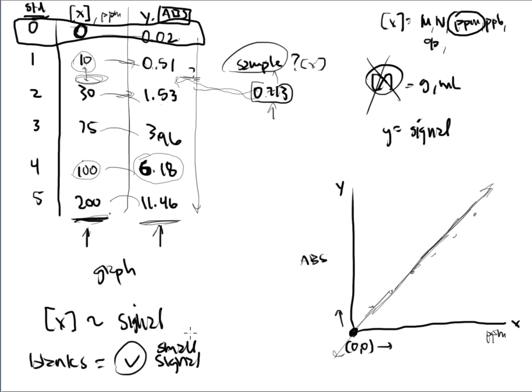That's normal. The instrument, there's air associated with it. There could be air associated with the solvent, the blank that you've used. Maybe it contributes a little bit to the signal. Not much, but maybe a little bit. Whatever the case is, that's the purpose of running the blank.